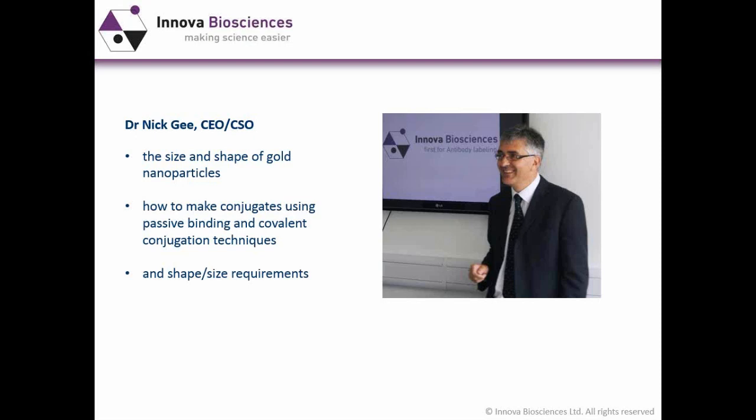Today, Nick will outline how to determine the size and shape of gold nanoparticles, how to make conjugates using passive binding and covalent conjugation techniques, and the shape and size requirements of different applications.